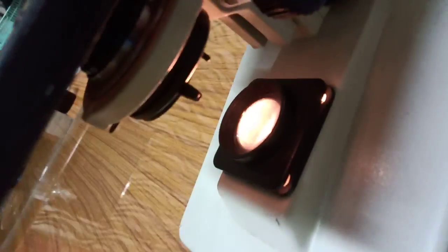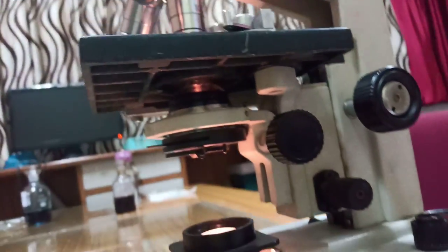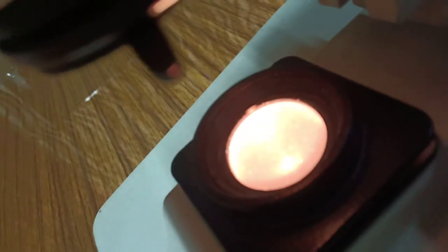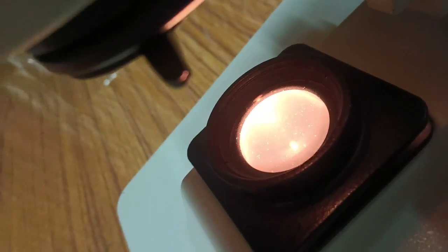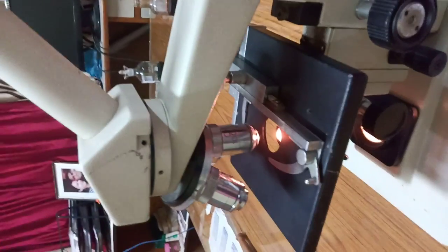There are different types of microscopes, students. Based on the source of light, microscopes are of two types. They are light microscope and electron microscope. The microscope in which ordinary light is used as the source of illumination is said to be light microscope. The light microscopes are again of two types. They are simple microscopes and compound microscopes.